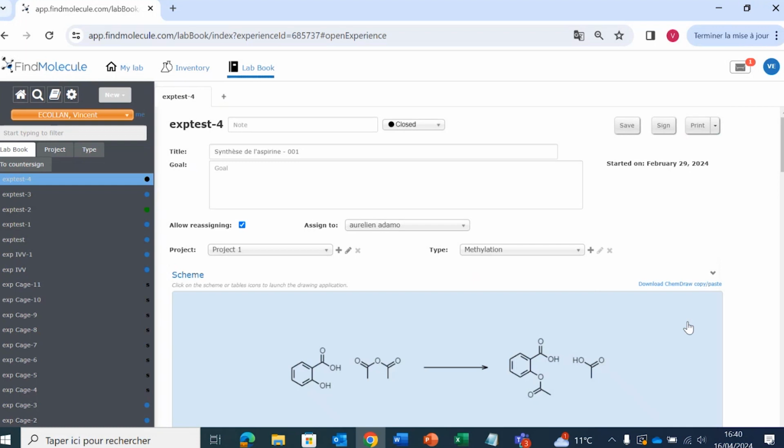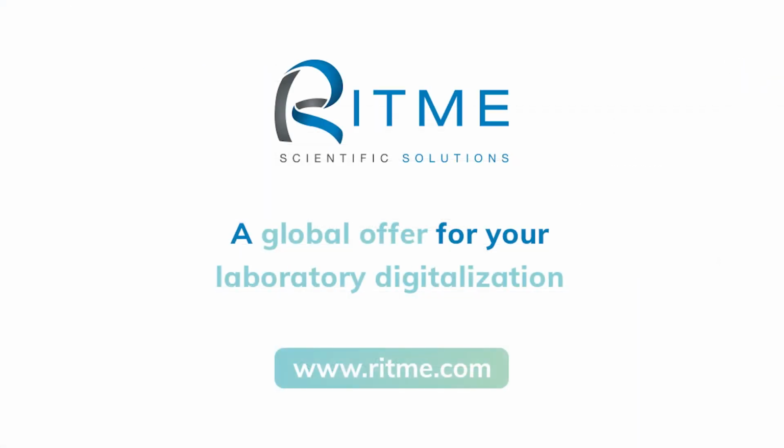So this was an overview of FindMolecule. Feel free to reach out to us if you want a more detailed presentation.